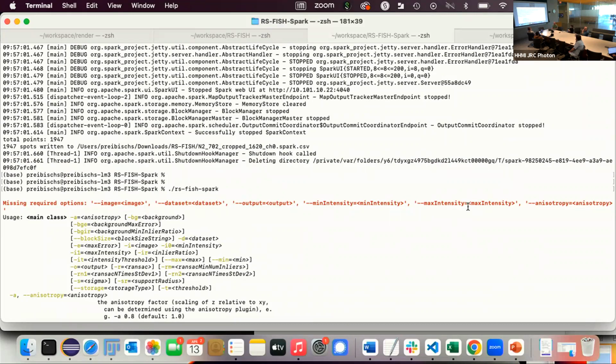That just makes no sense, right? So that's why it wants to know the min and max. It's not that you have to know it. When you do it in Fiji, I do 0 to 65535, and that's it. It doesn't have to be actual values. It just has to be consistent, right? That the parameters you find work with this min and max.